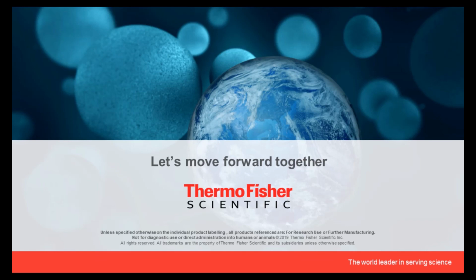And from a biosafety perspective, we need to understand what these targets are as well, so when we're doing the development work, we're safe as well. It also helps if they're purchasable. From a release assay standpoint, if it's something that you could actually buy from outside vendors as a research use product, we'll use that in the release assay test as well.